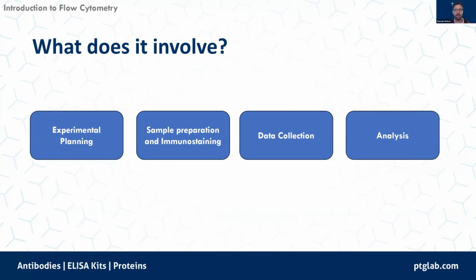And without doubt, this is the area that I would hope that you and I certainly did spend most of my time thinking about when it came to my experiments, particularly if you're working with larger antibody panels. Sample preparation and immunostaining is obviously the day in the lab at the bench doing your sample prep and staining your samples with your antibody panel.